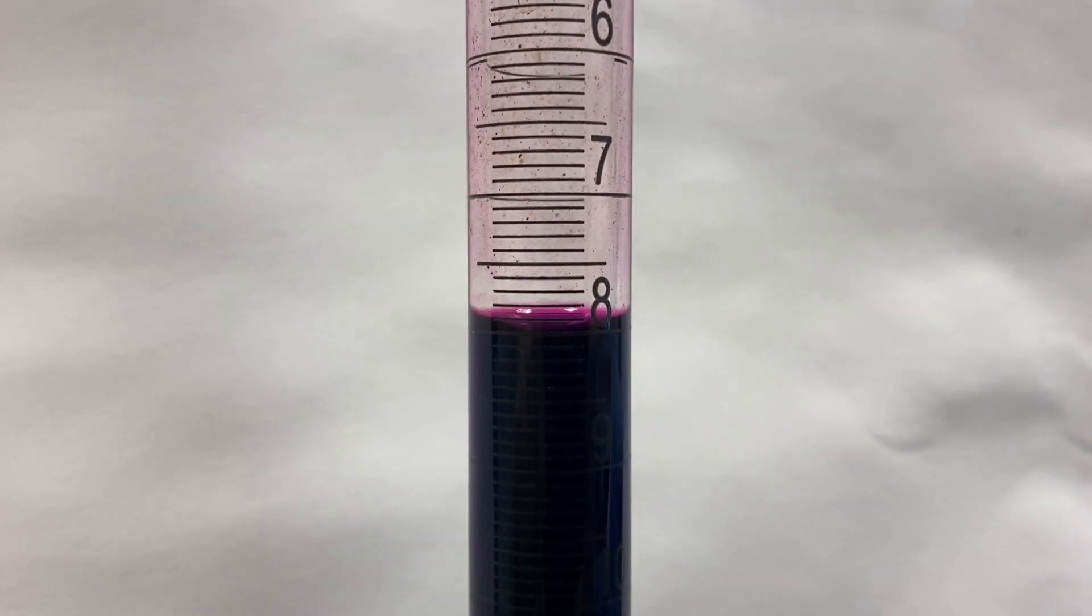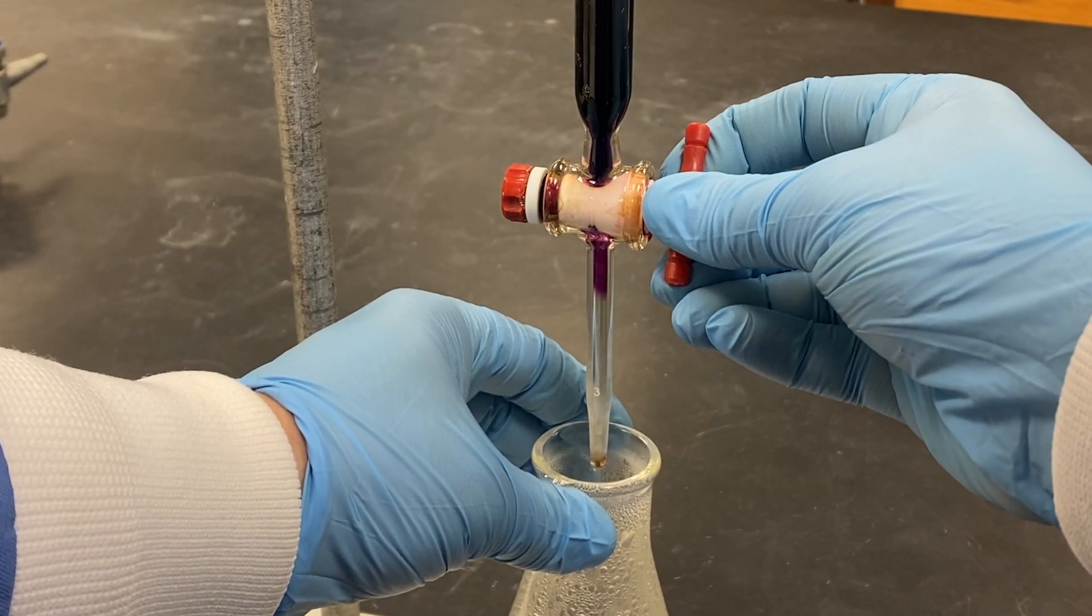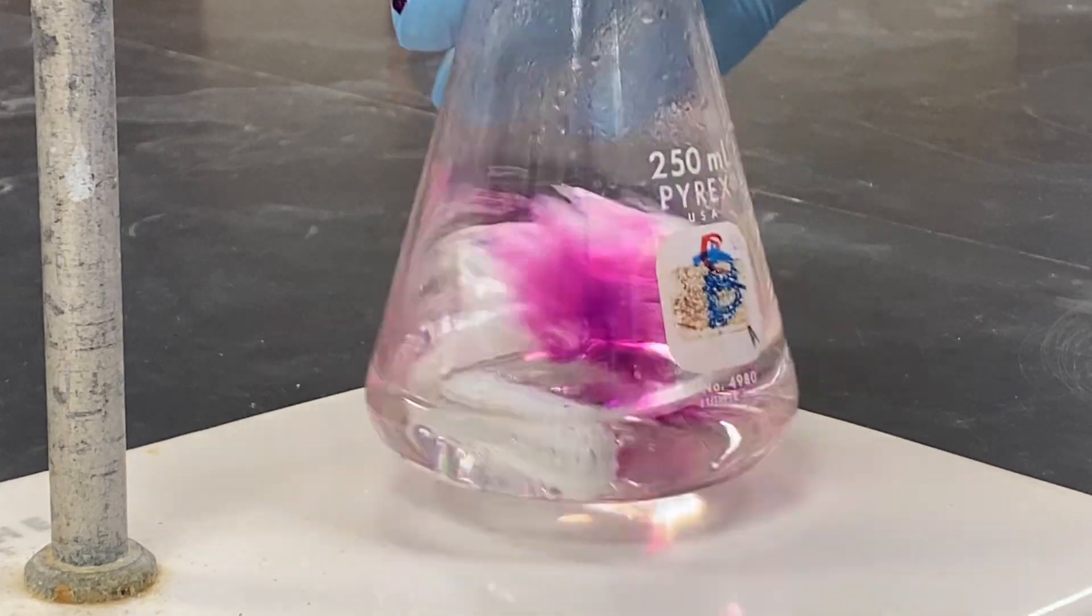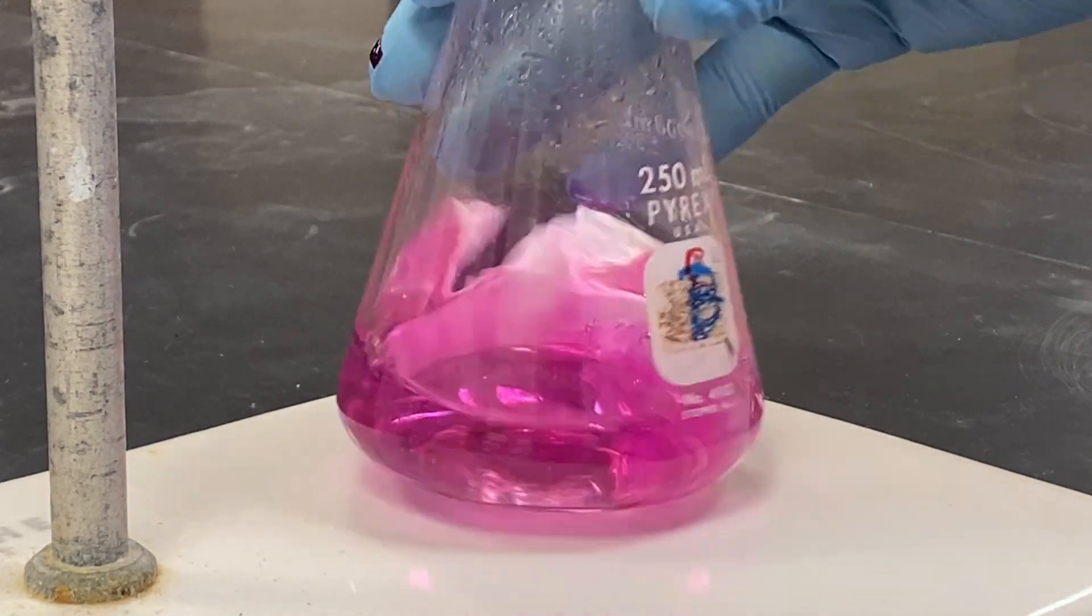After recording the initial volume, the titrant is added until the endpoint is reached. If the solution drops below 60 degrees during the titration, it should be reheated.